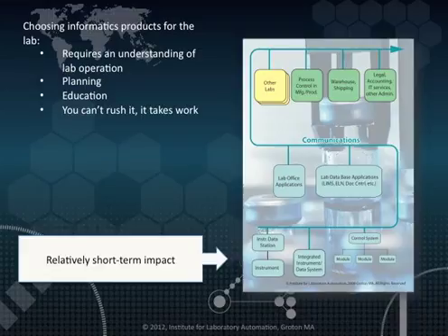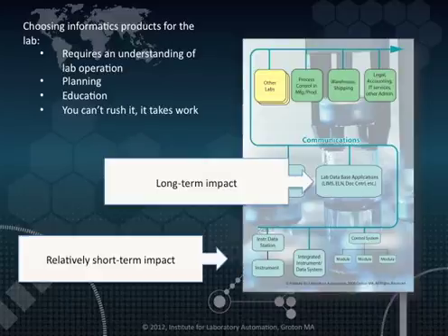Problems that occur in product selection and implementation on the lab bench can be severe, but have a relatively short-term impact. They can be fixed without disrupting the overall lab's operations. Problems that occur with laboratory informatics systems, because of their cost and the time it takes to implement them, are going to have a major long-term impact. They can't be replaced easily and require a migration strategy to move from one to the other so that you minimize the disruption in laboratory work.